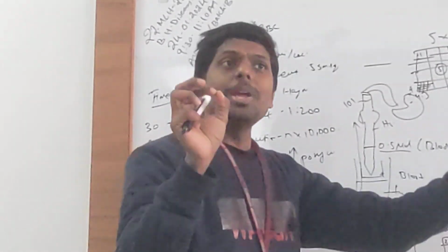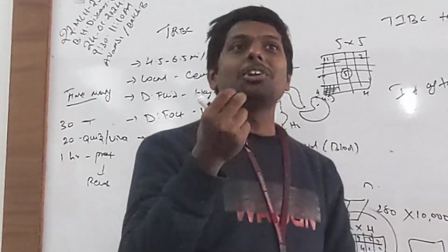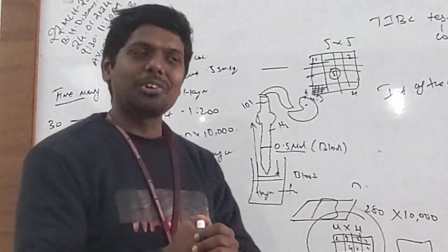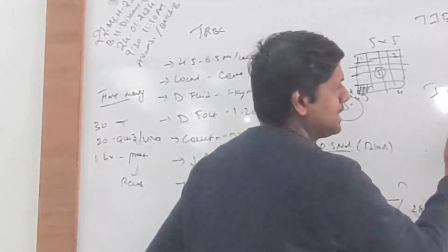We already know. How we are measuring Beer Lambert's law? What are the parameters we need to obtain to derive the calculation? Tell me now. Yes. Tell me the formula of Beer Lambert's law.